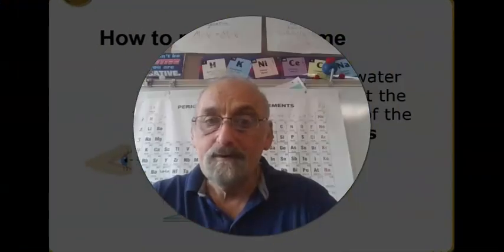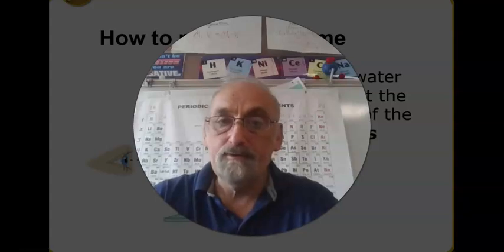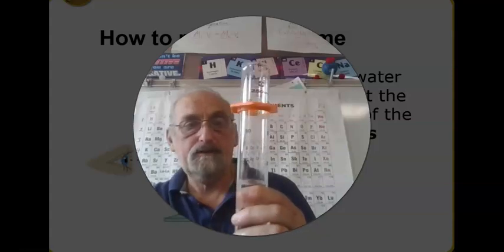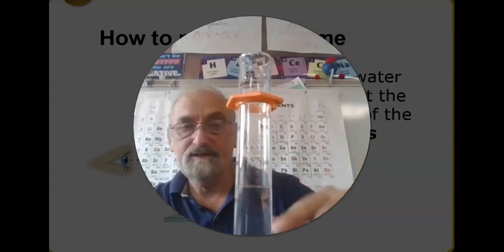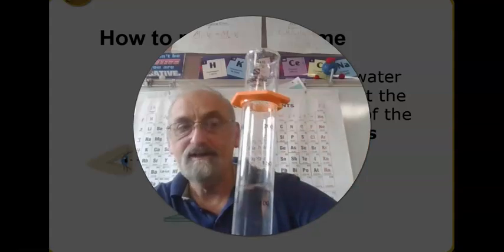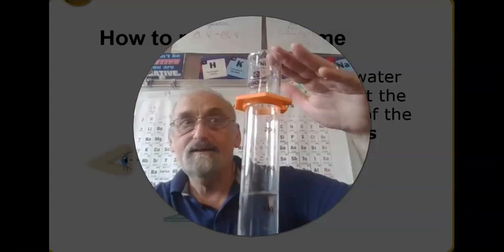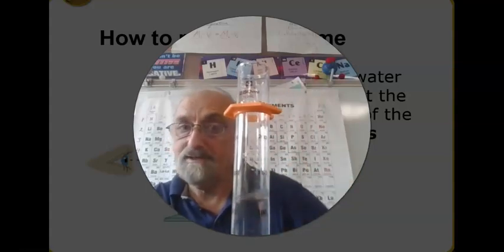Now, how about volume? We've got several different pieces of equipment that we use to measure volume. And one of the most useful ones is this. This is called the graduated cylinder. And it's called graduated cylinder because it has graduations on it, markings. Just like, you go through first grade, second grade, third grade, fourth grade, and then you graduate. Well, this goes from 100 to 150 to 200 milliliters, and it becomes a 250 milliliter graduated cylinder. So graduations basically mean levels.